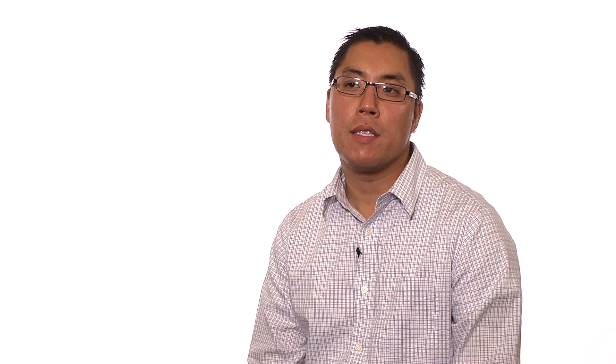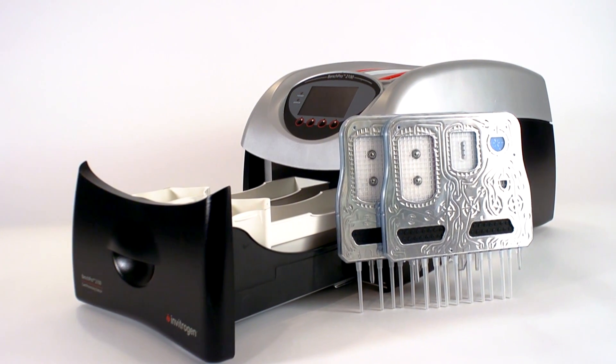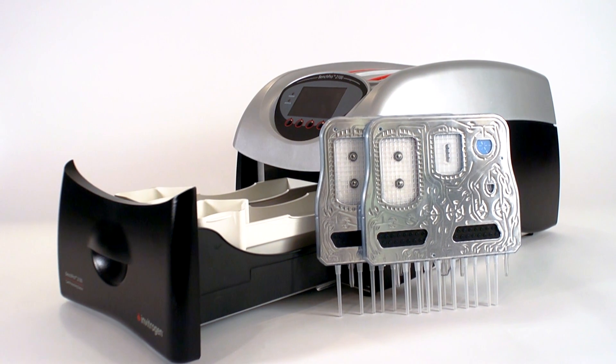My shoulder is sore, but it's a great, efficient piece of equipment to have in the lab, and I don't want to go back to doing another maxi prep from a kit again. You can learn more about the BenchPro 2100 system at www.lifetechnologies.com/BenchPro2100.